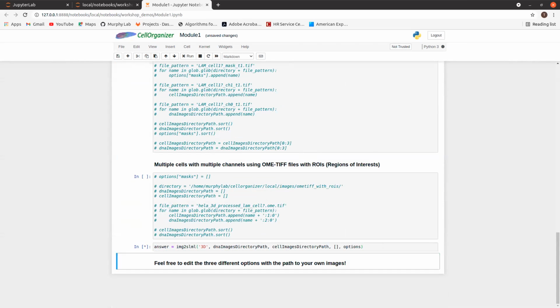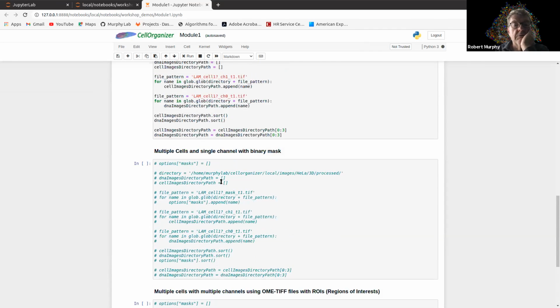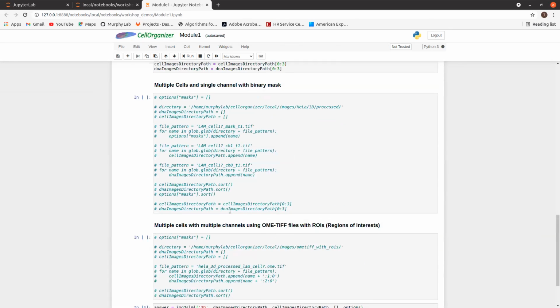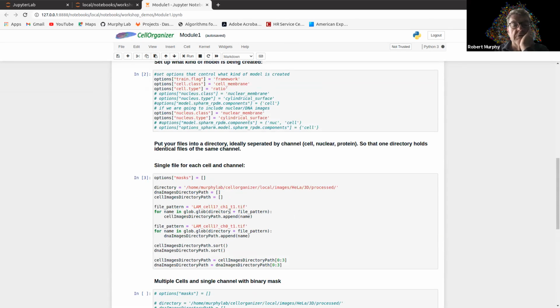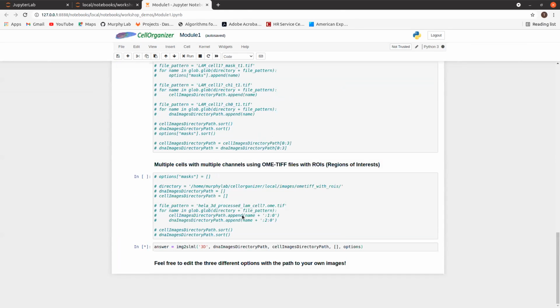Robert, sorry, quick question. Where is the source code located? But you have to run all, Ted, not just the last line, right? No, because these are the different ways to do it. But did you run the one that you're using? Yep. Okay. This one's being run. Sorry, go ahead. There was a question.